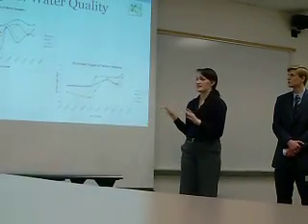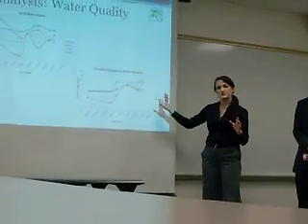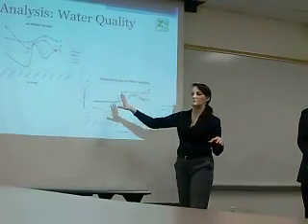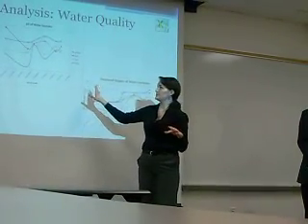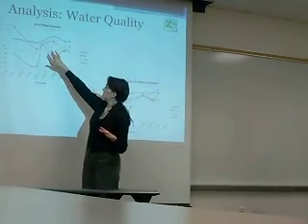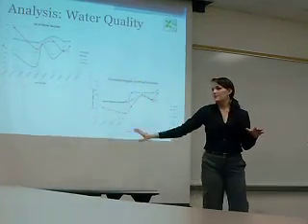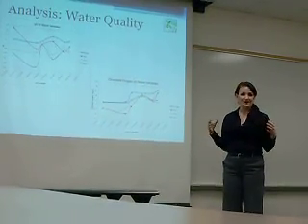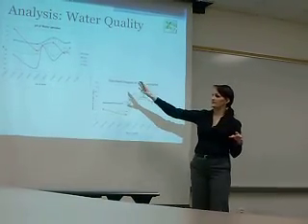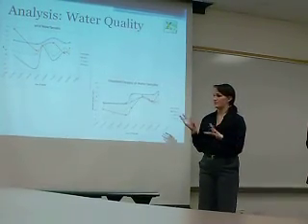So this is some of the analysis we did in Excel. And basically what we were looking for here was any kind of pairing and trending of the data. The dissolved oxygen doesn't really show us much, but one thing that was particularly interesting about the pH samples was that after we see this bump in the samples at the reservoir, we see a similar bump a short time later in the water that we saw at the brewery. And the delay is obviously because you're not going to use the water in the reservoir in the brewery that day. So we think that this could indicate the delay, the potential length of the delay between the reservoir effects and the brewery effects.